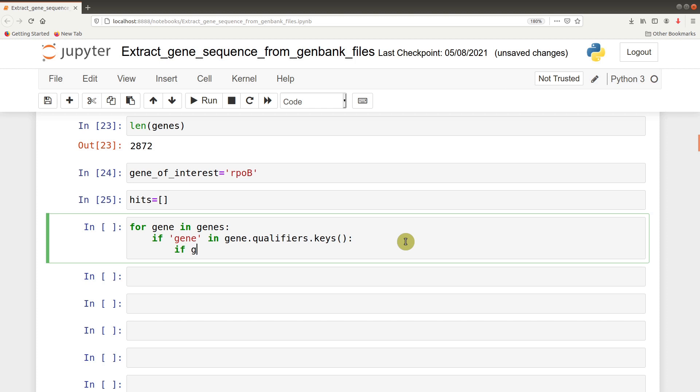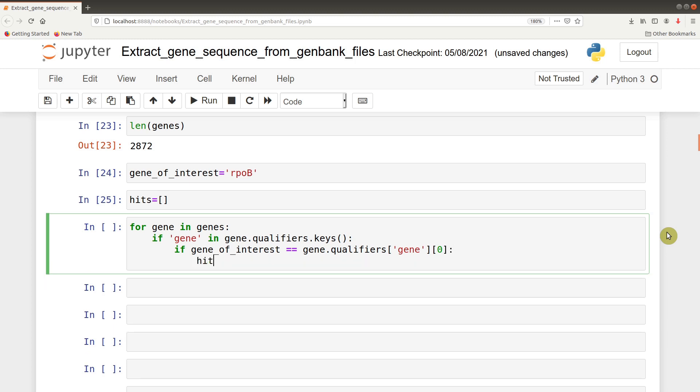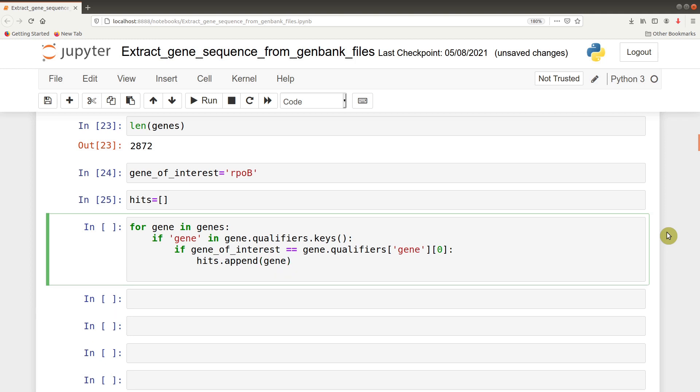To do that we say if gene of interest equals gene.qualifiers gene. If it's there, then hits.append gene. We can also issue a print statement just to track what's happening if you're dealing with multiple steps. So you can say print gene found. That means if the rpob gene is identified, it should print this so we know what's going on.